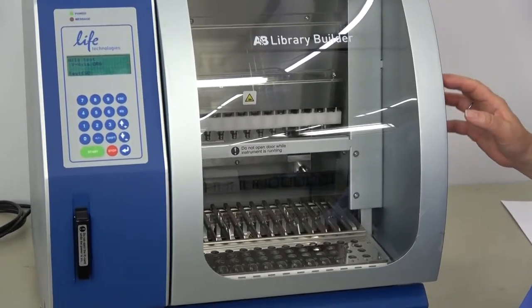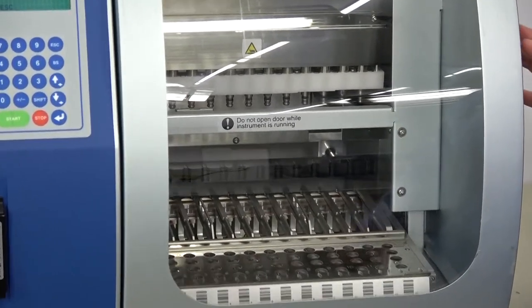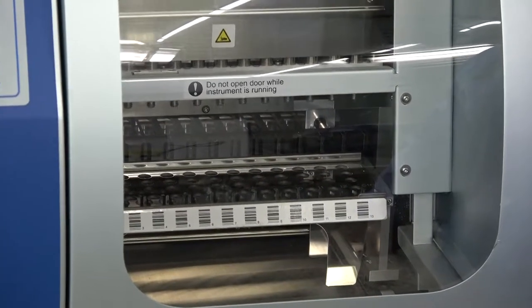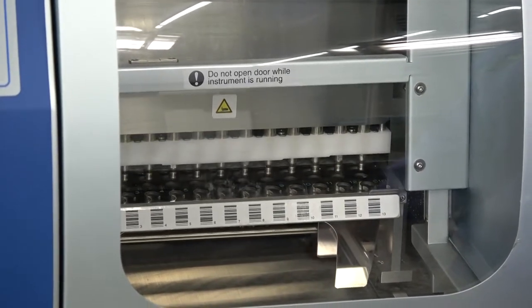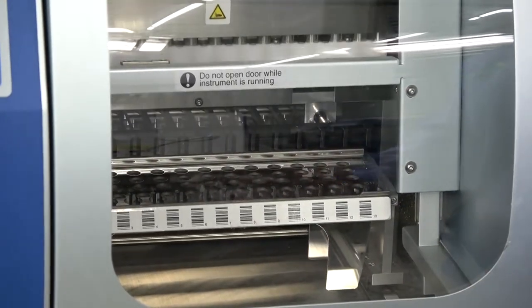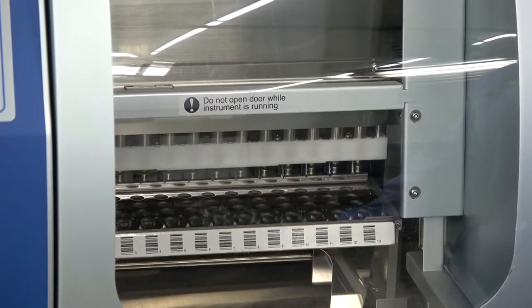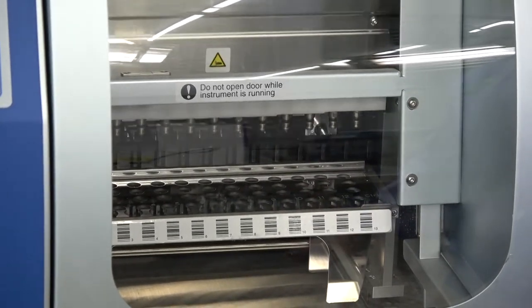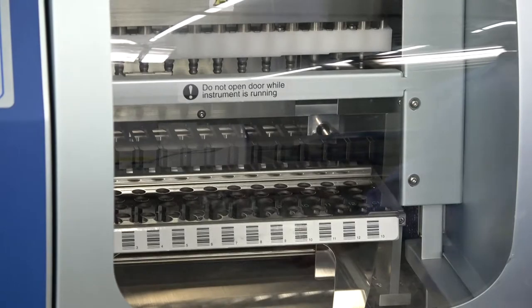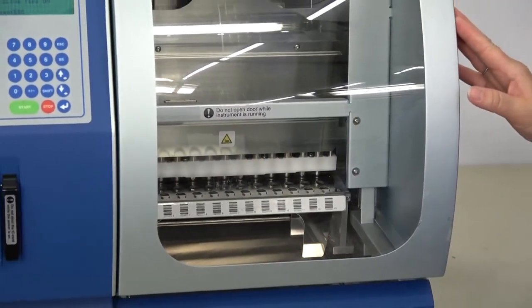This particular item can do 13 libraries per run — you can do 13 libraries each day. It is set up to load and walk away and run completely on its own. It features the ability to use plug-and-play reagents which are available from the manufacturer, and it has push-button protocols that you can enter in.